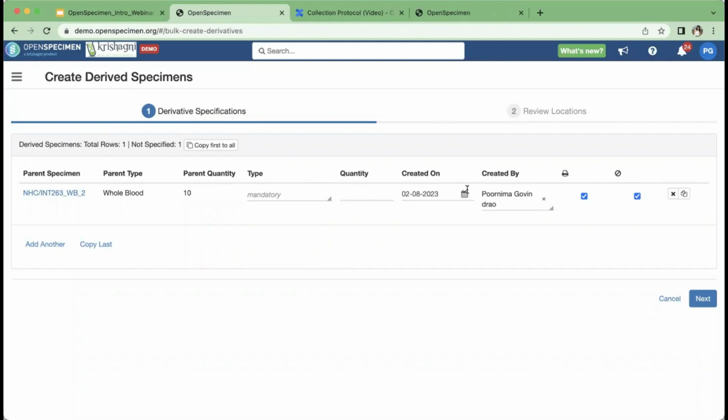Let me just see. I think I got lost a bit. Sorry, to clarify, does it not get added to the parents? Is there a way to add directly to a aliquot? Yeah. So there's a follow-up question about adding data to a specimen. Yes, you can add it to a parent specimen as well as directly to an aliquot. You can add data to any level. So there is no restriction on that.